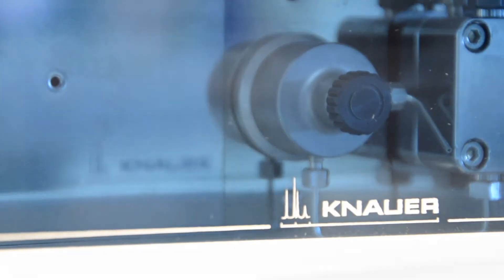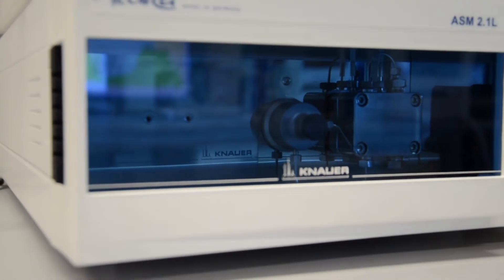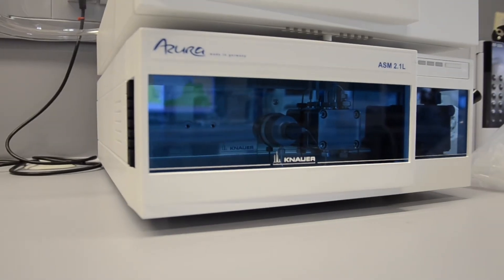The AZURA system is a great system for this kind of application because you are really flexible. You can set up your system to the method you want to use, and what is really important is that we have software that helps to set up such experiments.